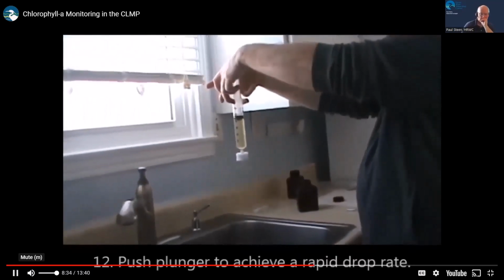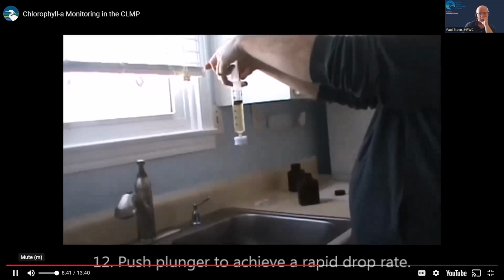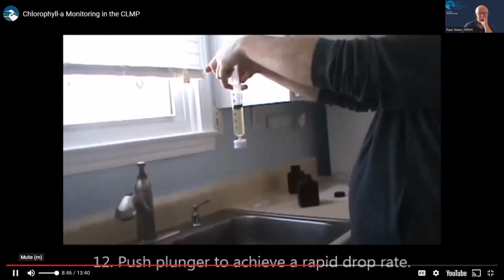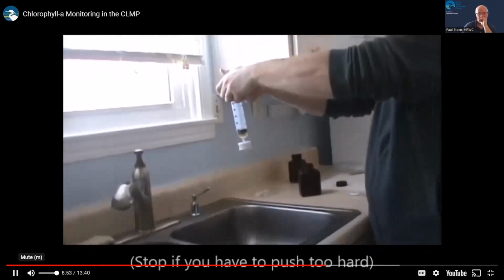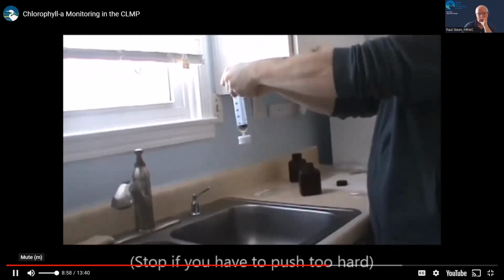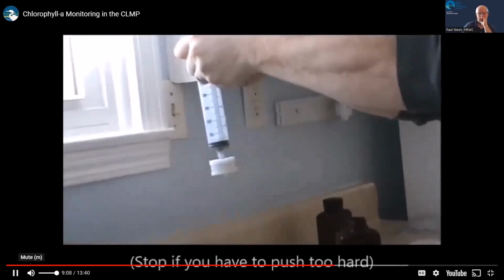Slowly push the chlorophyll sample through the filter holder and adjust your pressure to achieve a rapid drop rate. Pushing too hard may rip the filter, so avoid excessive pressure. As you push the plunger, make sure that no water is leaking out the side of the filter holder. If your sample has a lot of algae or other particles in it, it may become too difficult to push the full 50 milliliters of sample through the filter. In these situations, stop pushing and note how much water you were able to filter by reading the side of the syringe. There is a place on the datasheet for you to record this information.